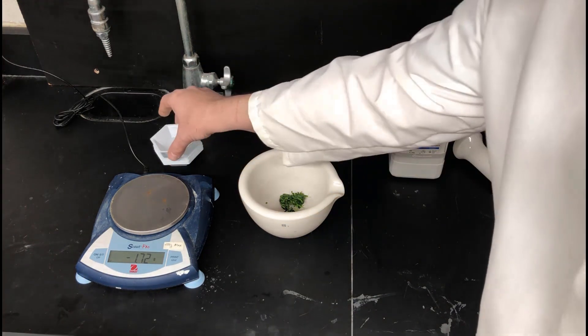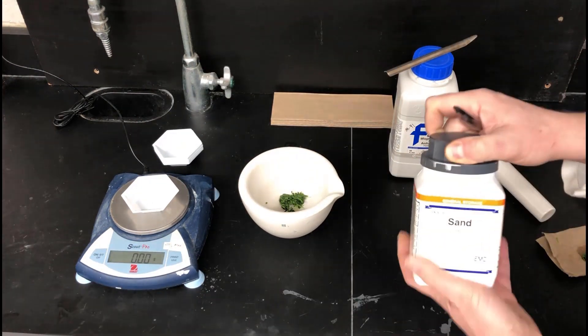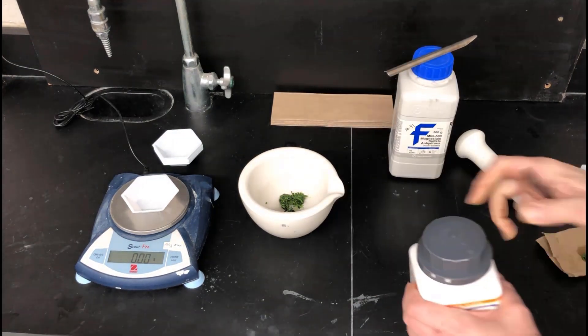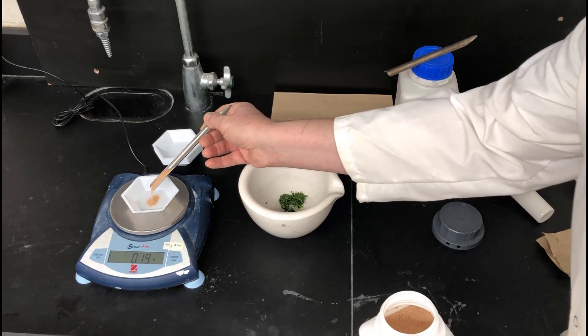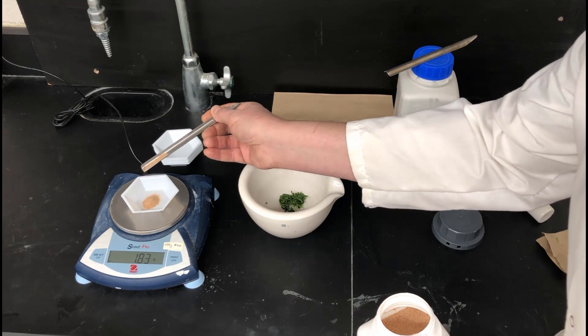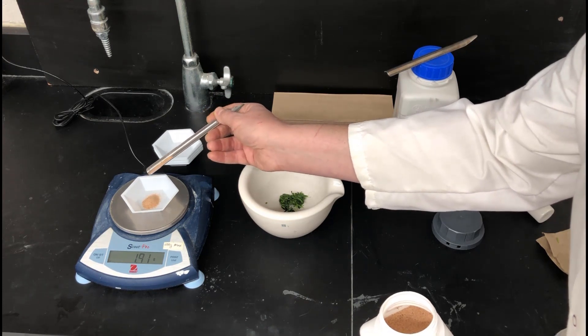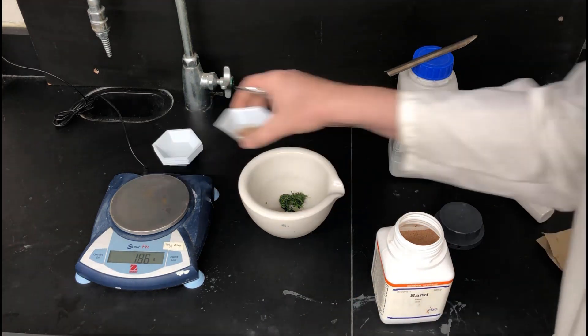So to assist with the grinding process, we are going to next weigh out some sand. The sand is an abrasive material that will help to grind up the pigments or the leaves and the pigments and allows the extraction to work a little bit better. So here, just weighing out about two grams, and then that sand goes right into the container.